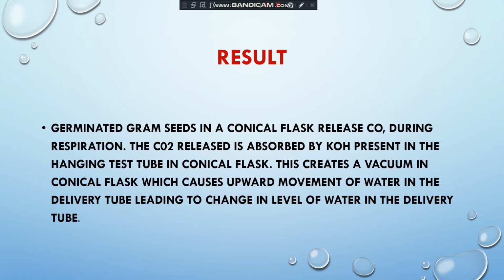What is the result? Why does it happen so? Because the germinated gram seeds in the flask release carbon dioxide. Carbon dioxide is released during respiration, and the carbon dioxide released is absorbed by KOH. Here the KOH, potassium hydroxide, is absorbing the carbon dioxide.